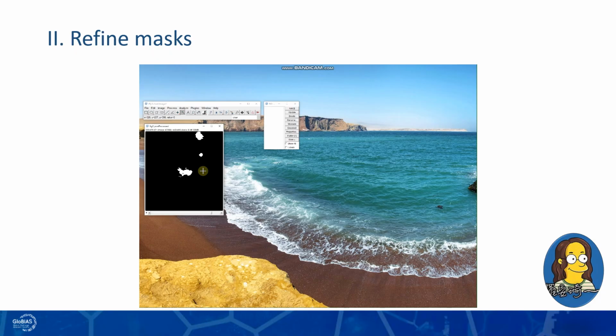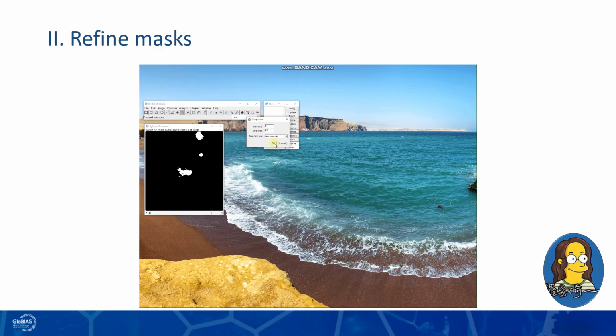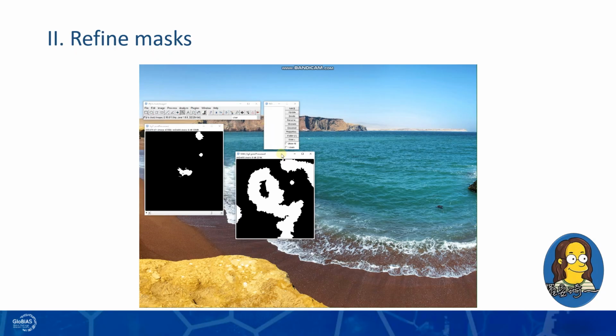To remove unwanted cells, we can use the trajectory of the target cell as a mask. First, use the Z Projection function under the Stacks menu to generate a projection image showing the cell trajectory. Next, select the trajectory, use the Wand tool, and add it to the ROI Manager. Then, apply this ROI to the entire stack and use the Clear Outside function to remove objects outside the trajectory region.